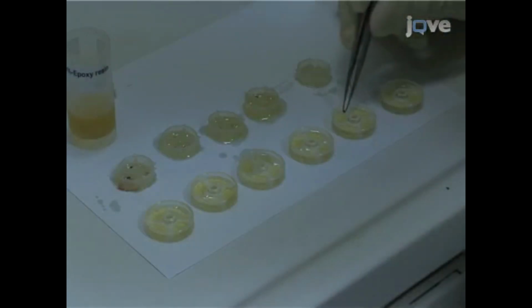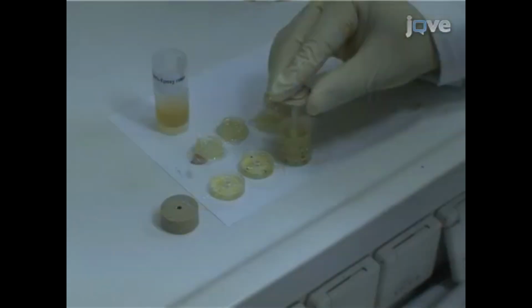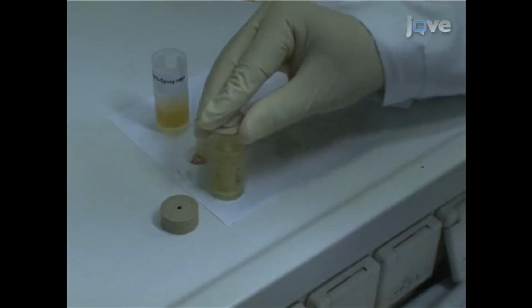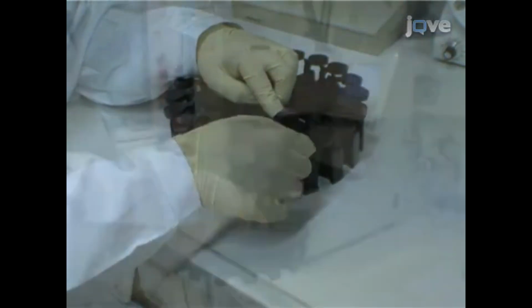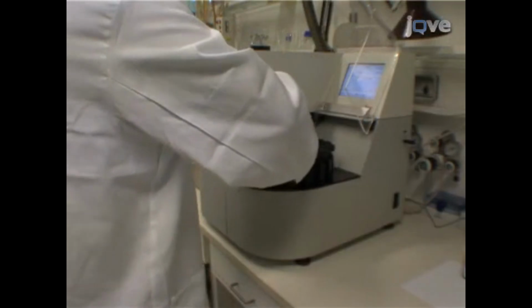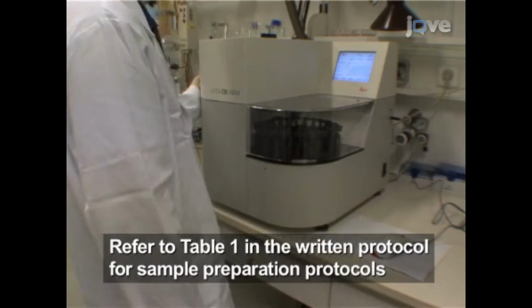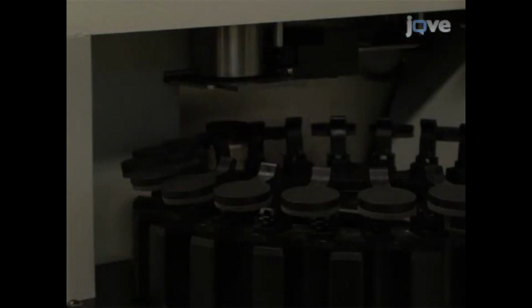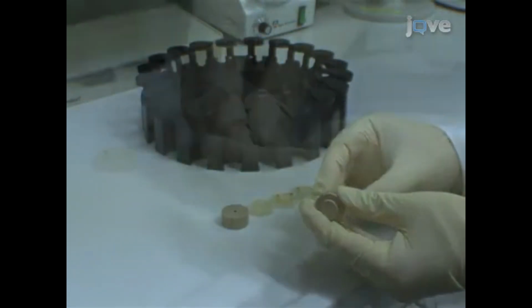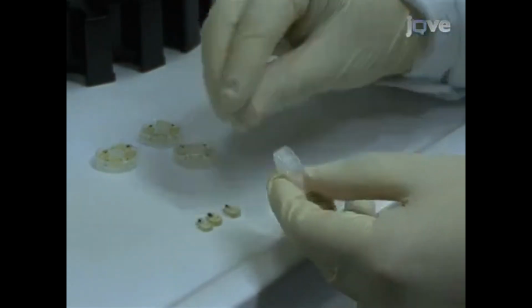Using fine tweezers, load the samples into the designated polymerization forms. Next, stack the polymerization forms on top of each other and remove the previously used vials from the carousel of the microwave tissue processor. Load the carousel with the stacked baskets and insert the carousel into the microwave device. Now, start the previously programmed polymerization protocol. After the protocol is finished, remove the polymerization forms from the monomode chamber and unstack them. Remove the polymerized blocks containing the samples, which are now ready for sectioning with a microtome.